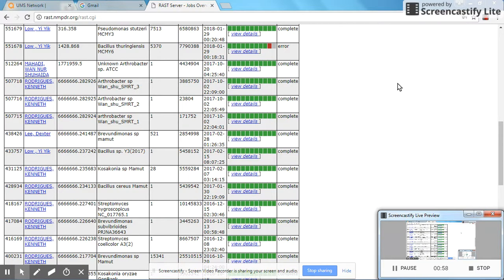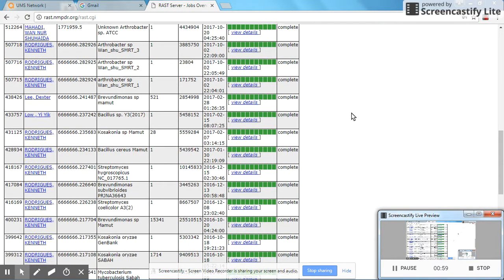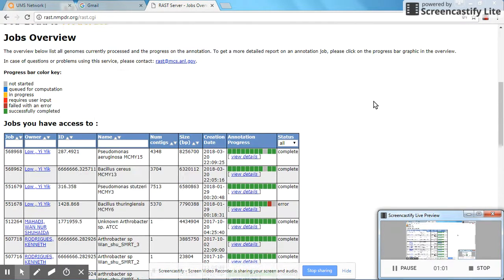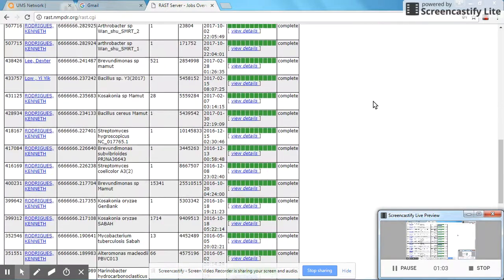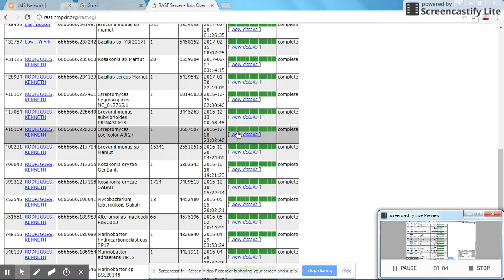I have uploaded some genomes into the system. As you can see, the green bar indicates that the job has been completed successfully.